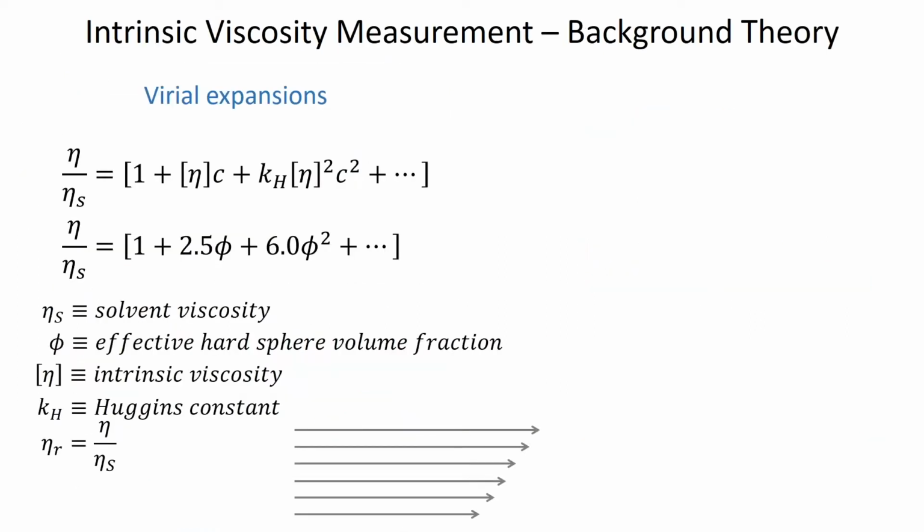Okay, so now it's necessary to put some equations up, even if it's kind of painful, just because it makes it a little more clear, I think, what the parameters mean and why they mean what they do. As we increase the concentration, and this leads to the increase in viscosity, we're adding complexity to the system.